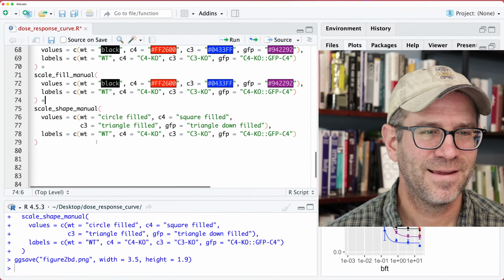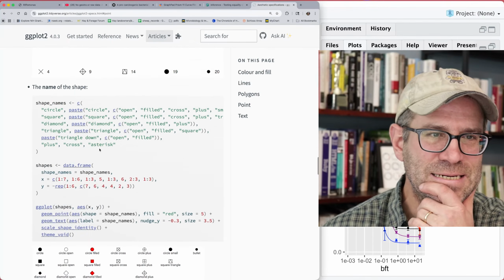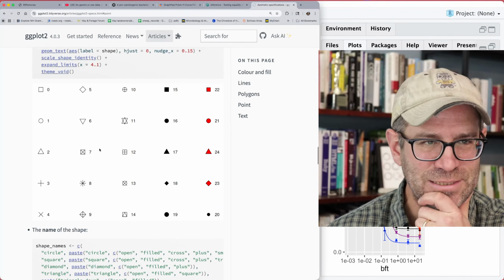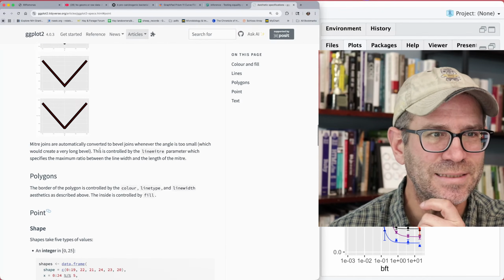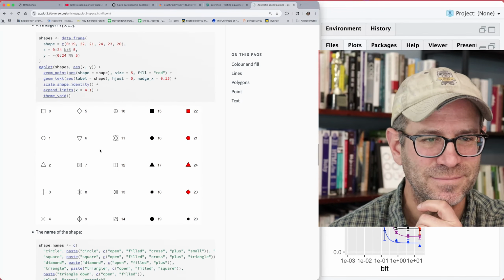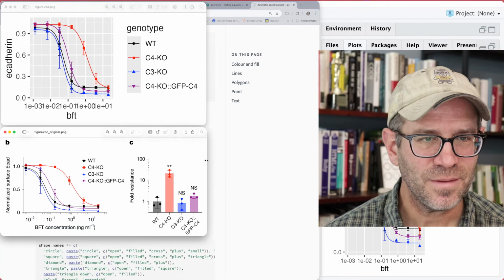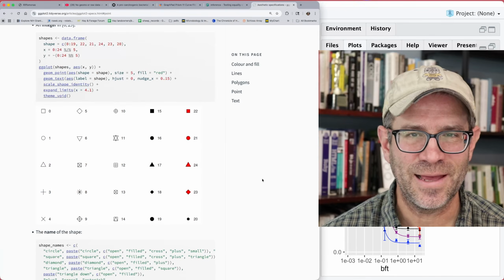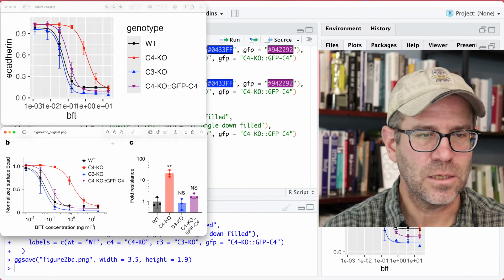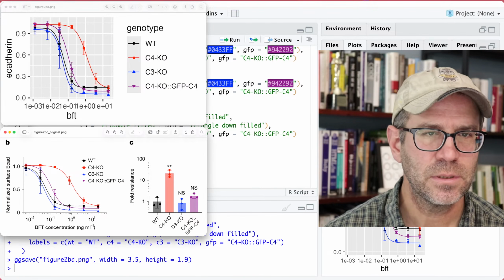All right. I was looking at this and thinking, I wonder what 25 is. I don't see 25. I wonder if 25 is what I actually want. And so it goes. That's fine. So, all right. Thanks for chiming that in. That's great. All right. So we've got our colors, we've got our shapes, we've got our labels.